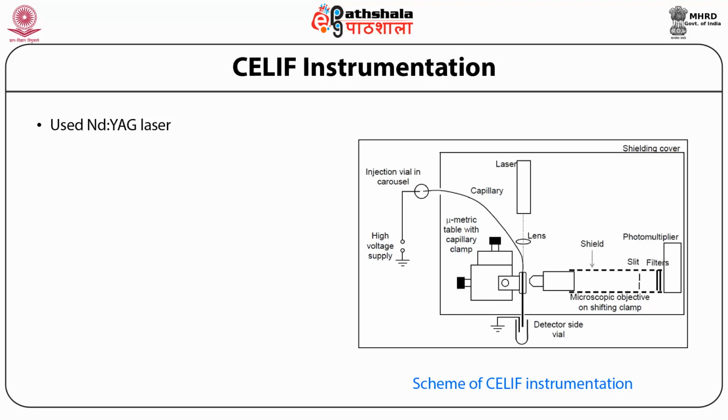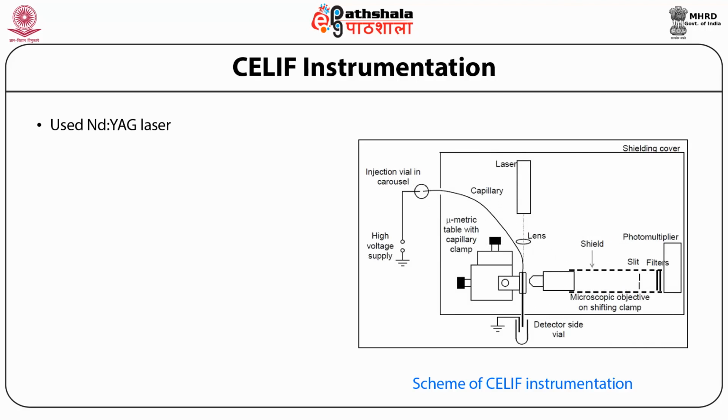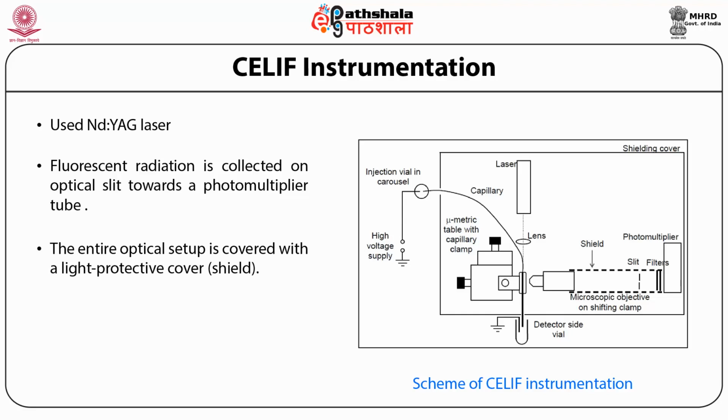The instrumentation is equipped with a DPSS Nd:YAG laser, diode-pumped solid-state neodymium-doped yttrium aluminum garnet, 1064 nanometer, with a frequency doubler emitting light with a wavelength of 532 nanometer. The laser beam is focused with a quartz lens with a focal length of 10 millimeter into the center of the capillary held in an adjustable clamp positioned on a micrometric XY stage. Fluorescent radiation is collected with a microscope objective and directed through an optical slit and spectral filtration towards a photomultiplier tube (PMT). Two filters are inserted in front of the PMT to ensure optical filtration. The entire optical setup is covered with a sealed light protection cover.